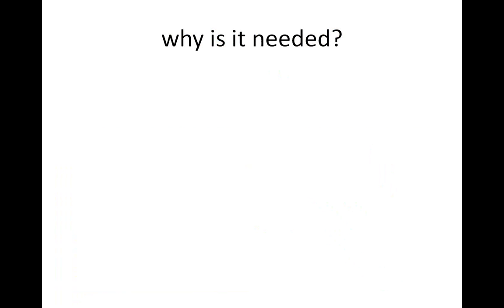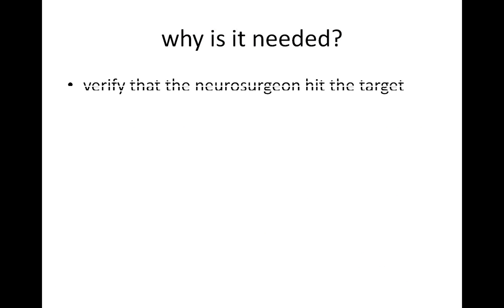There are two main reasons why it's needed, especially in the context of neurosurgery cases. The number one reason is that the neurosurgeon needs to verify that he or she has hit the targets they were going for. This is kind of unique to neuropathology and neurosurgery because, for example, if you have a lung tumor or colon tumor or a breast tumor, it's really obvious where the tumor is. They usually already know what it is, and they're not so concerned about hitting the diagnostic tissue. They know they've got it. They're just trying to take it all out.